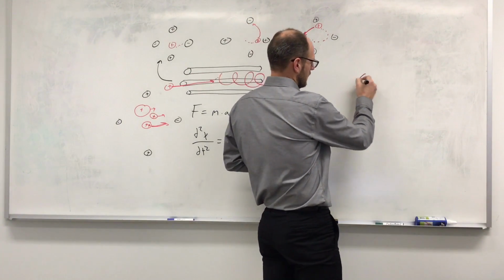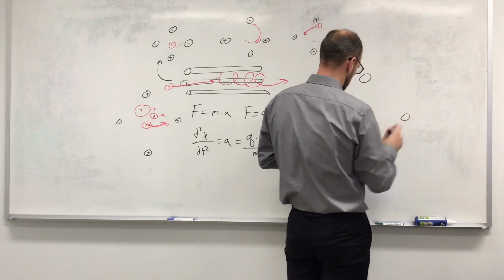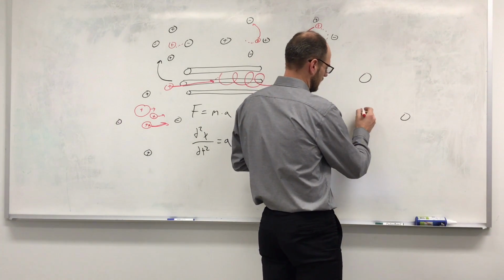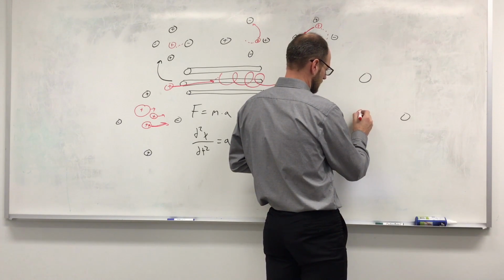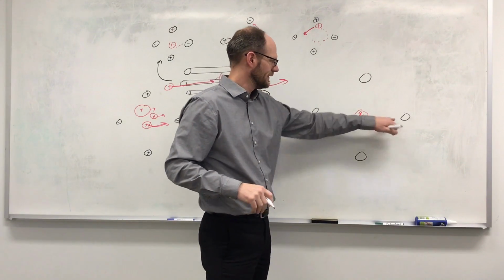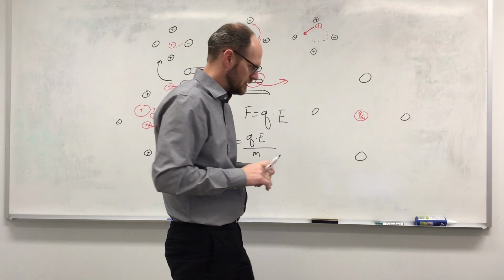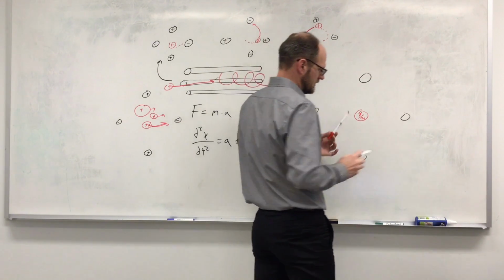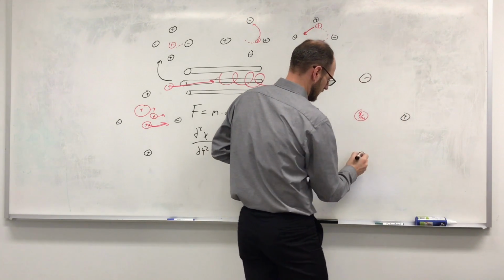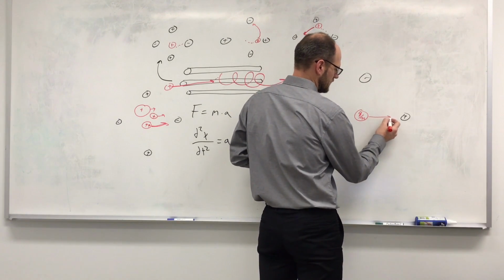Well, let's go back and consider our case now where we have our 4 quadrupoles. We know now that how quickly an ion responds to an electric field is proportional to its charge over mass. So how quickly it will move towards one of these rods is a function of those two things. So if we have a constant charge, let's say, like this particle, all the particles will eventually run into that rod.